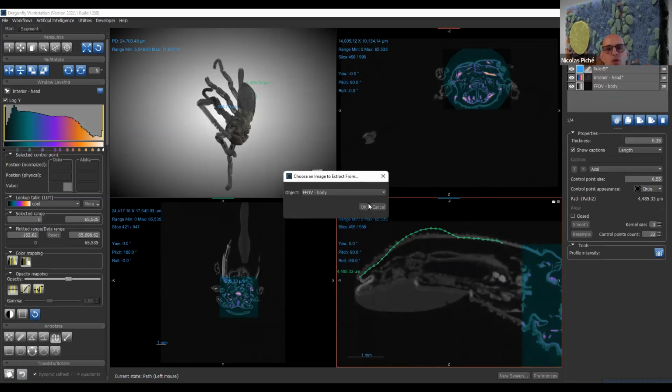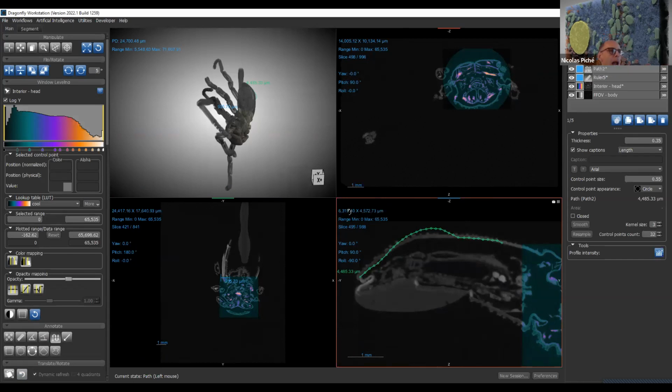So it will generate a new data set with, let's say, 100 voxel that is a normal extraction along the path. So let's say that you have followed a vessel or a track or something, and you want to stretch it out, okay, this is the way to do it. Sometimes it's good. Let's say that you're working on core sample of wormhole, and you want to straighten it to understand all the branching and stuff happening, well, this is a way to do it. But of course, the correspondence in space is not so good.